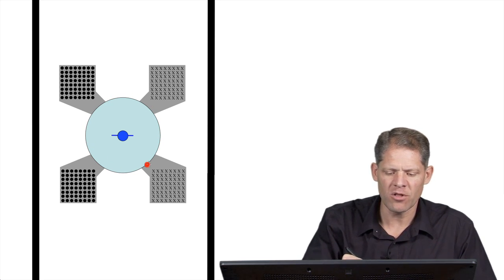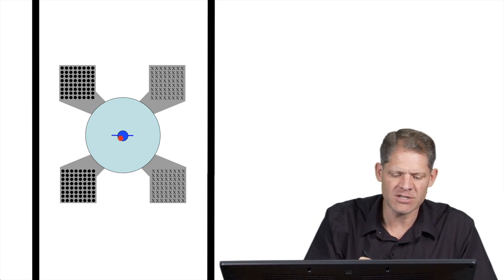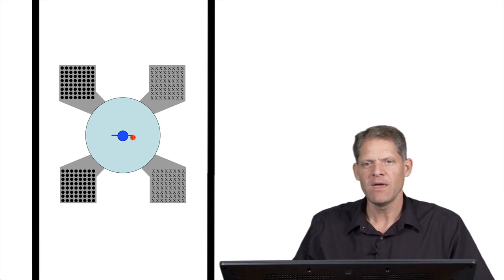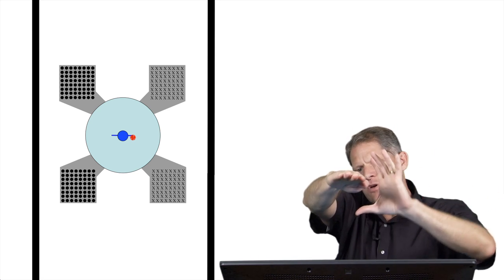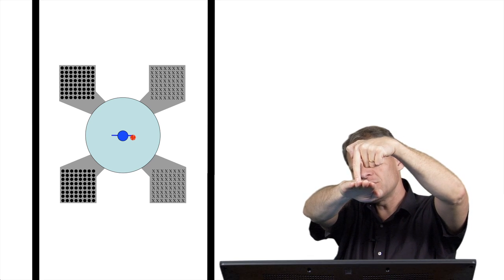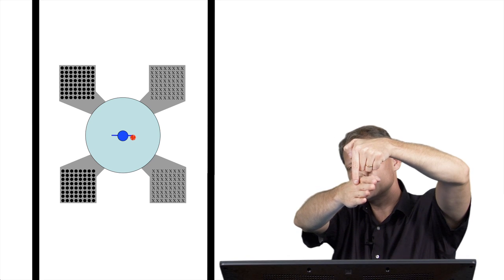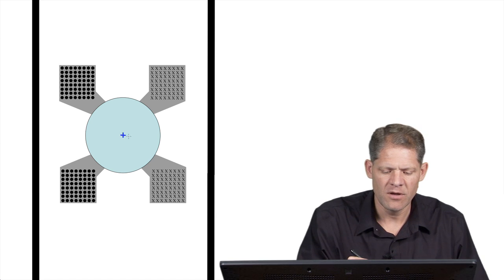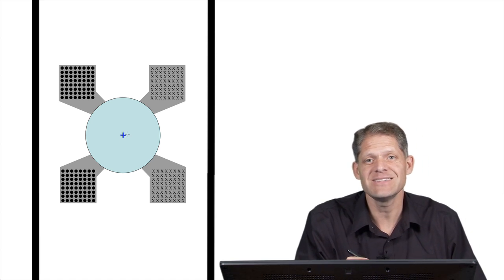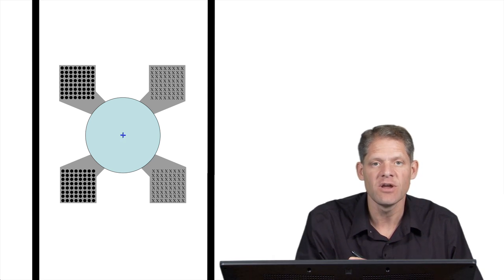And let the blue circle represent the tube of the goniometer. And then imagine that the specimen holder is this blue rod, and the specimen itself is this flat plate going across the middle. Now ideally, when you rotated the tube of the goniometer, the specimen and the target of interest, this is the beam coming down to the target of interest, would stay exactly in place as it was rotated back and forth. And if we removed the specimen from the goniometer, we would see that there is an axis of the goniometer that comes right through the middle, and let's put its axis of rotation right here.